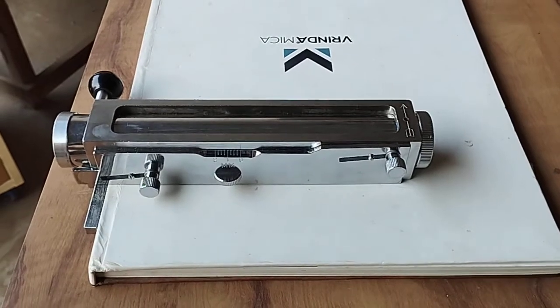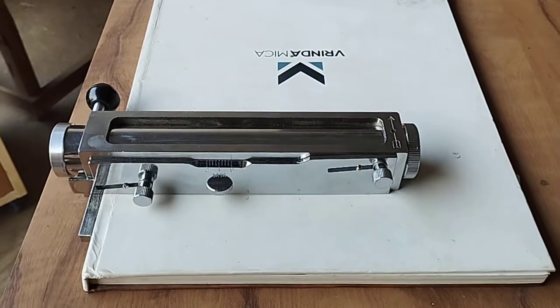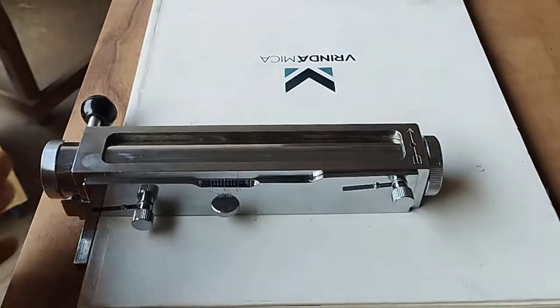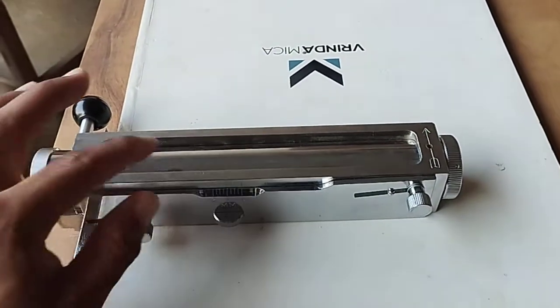I'm Jason from Harpalinsons firm in Ambalak, Haryana. Today I am going to show you the thin layer chromatography kit spreader. This is the spreader of the thin layer chromatography kit, and I am going to show you how it works.